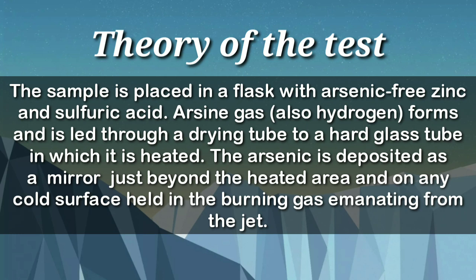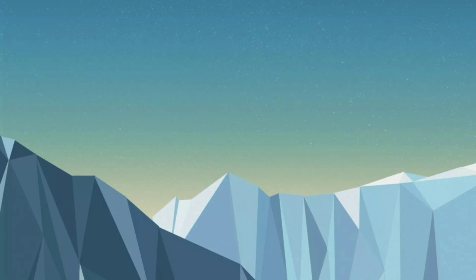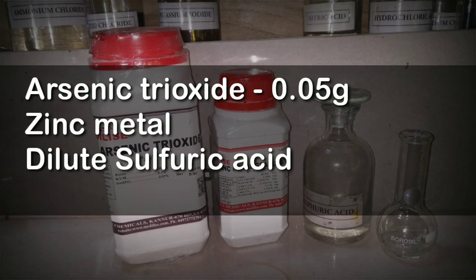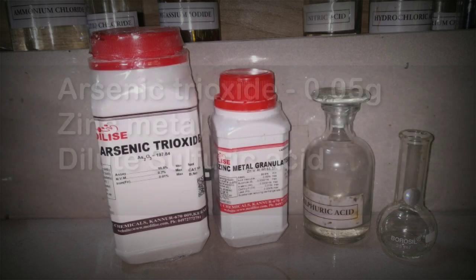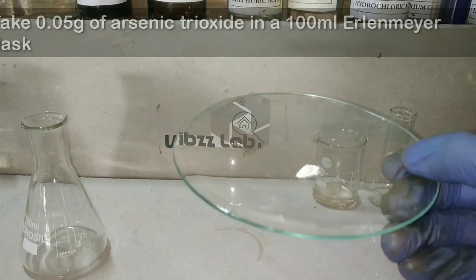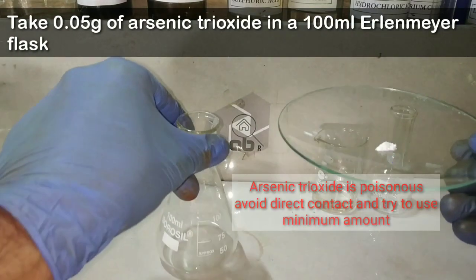In this test, the compound reacts with zinc and sulfuric acid to form the gas arsine, which gets thermally decomposed to give elemental arsenic. The arsenic is deposited as a mirror on the cold surface held against the burning gas. The materials required are a very little amount of arsenic trioxide, zinc metal, and dilute sulfuric acid.